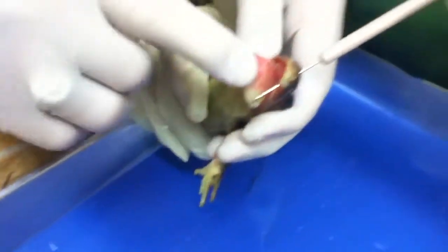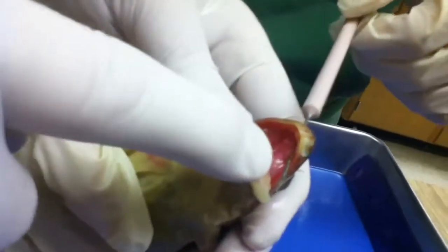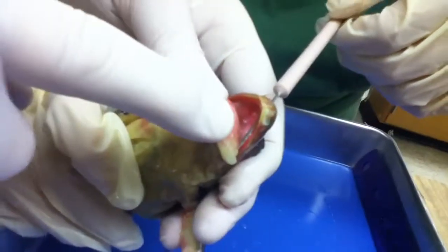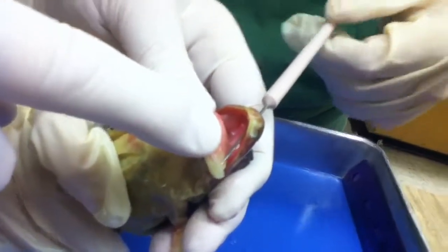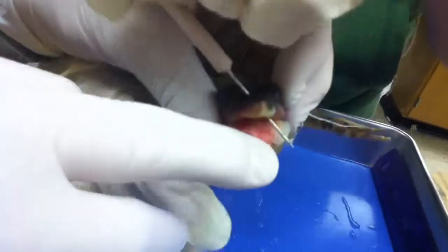Ew! So I went from my external nares into the internal nares. It's actually nares, okay? And I didn't just poke a hole through it, and you can see that. Do it from the other side. Okay, so do it now from the other side.